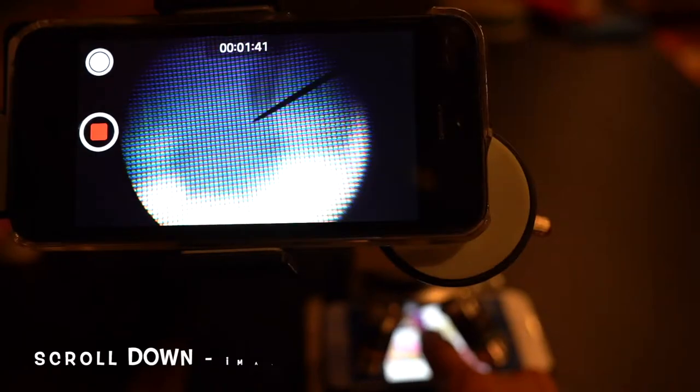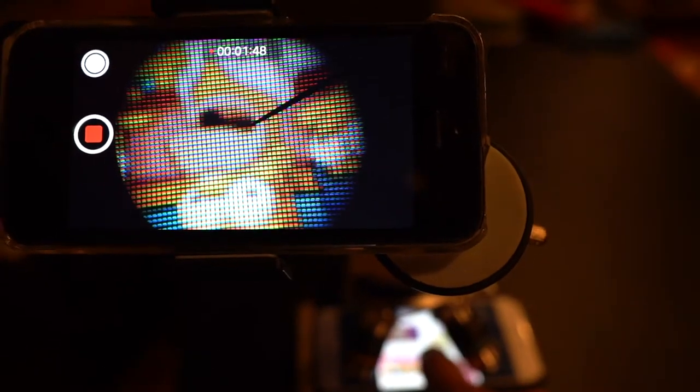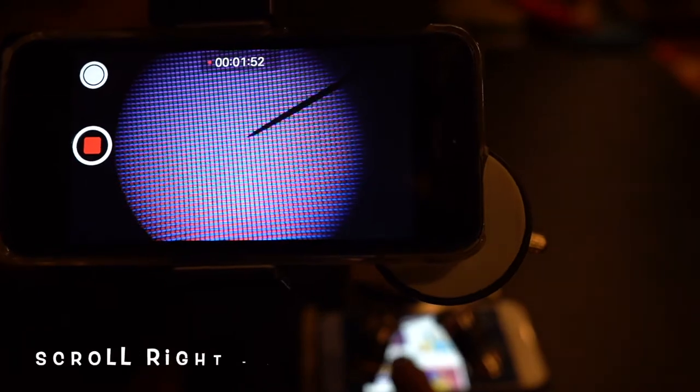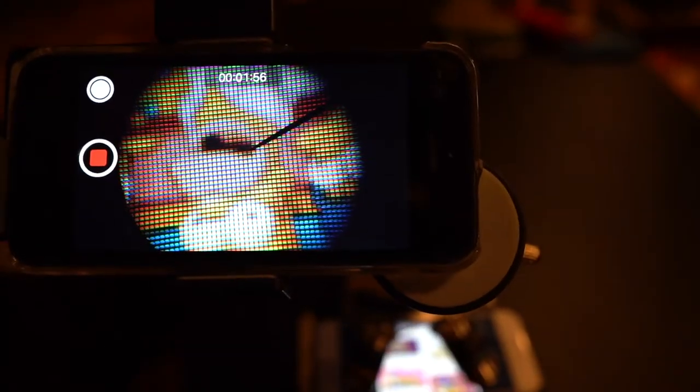So in the next couple slides we'll now look at how stuff moves underneath the microscope. Here I'm scrolling down and you can see the image moves up. Here I scroll up and the image moves down. Here I scroll to the left and the image moves right. And here I scroll to the right and the image moves to the left.